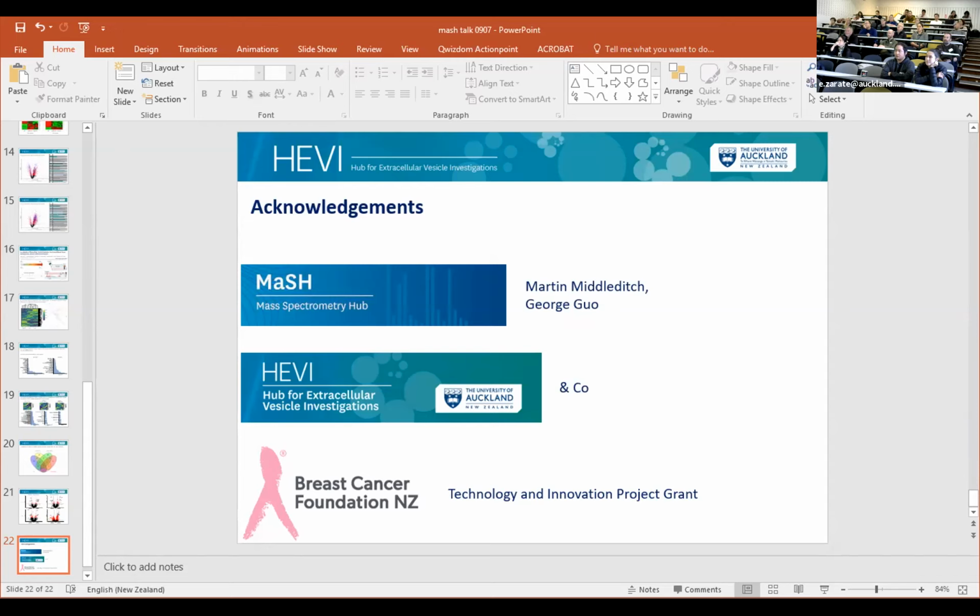It looks pretty low tech. The glass sublimator sitting in it cost me $4.99 from Kmart, so it's not all high tech equipment. Whatever works. Then it goes into the very high tech FTICR. Basically a laser rasters across the sample, shooting 50 microns apart. This is the resolution I'm looking at. Theoretically, it can go down to 10, but that's just on the label that the manufacturer is selling, I think.